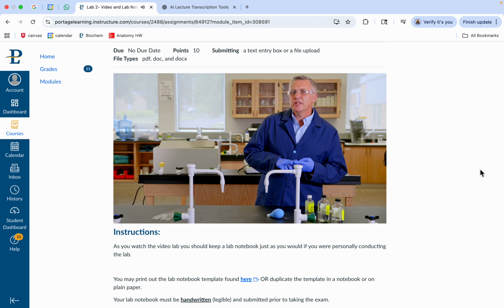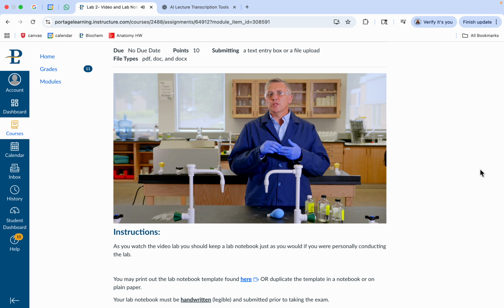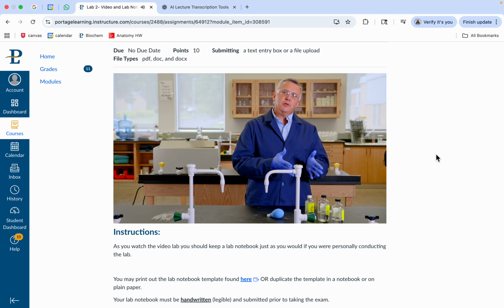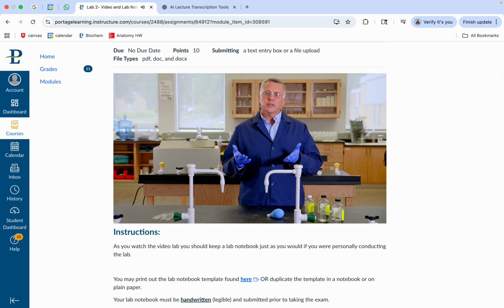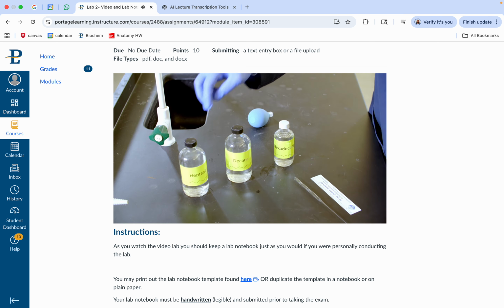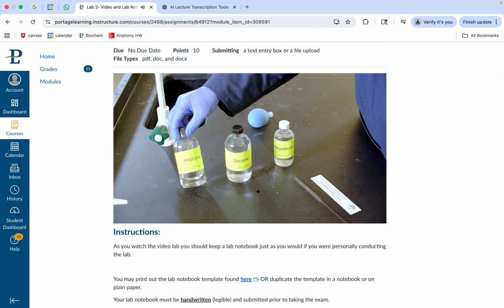So we looked at pentane, pentanone, and pentanol to help us look at the difference between London, dipole forces, and hydrogen bonds. We're going to do 3 more, and we want to focus in on London forces. London forces are often thought to be weak, and they have this temporary dipole, and maybe they don't impact flow nearly as much. But we want to take a look at that and see how important the London forces really are. So for this part, we're going to work with 3 compounds. One of them is heptane. Remember that heptane is 7 carbons, so it's just 7 carbons in a row.